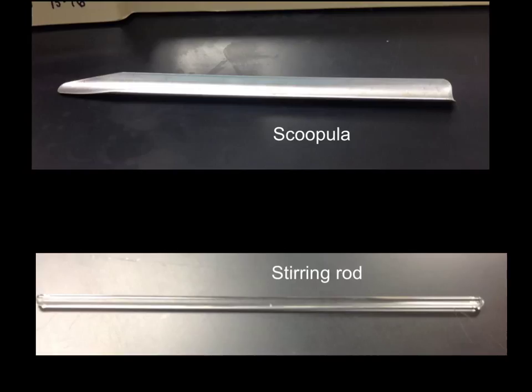A couple of other pieces of lab equipment you're going to use. One is called a scoopula, and it's really just what it sounds like. It's used to scoop solids into maybe a beaker or an evaporating dish or a watch glass, wherever you need that solid to go. It's like our chemistry spoon, really. And then you can also use a glass stirring rod, and just like the name says, it's used to stir things. It is made out of glass so that it won't react with any of the solutions that you're stirring.